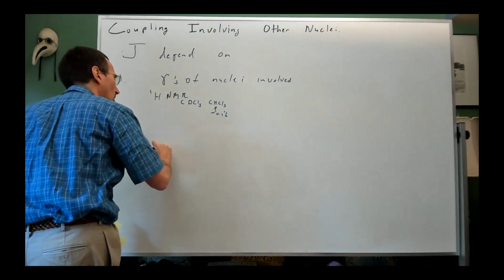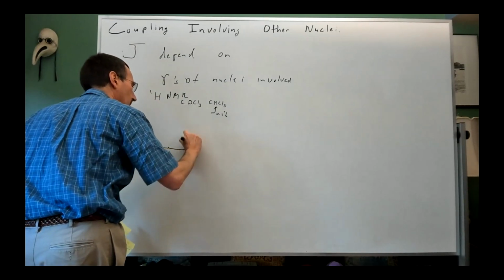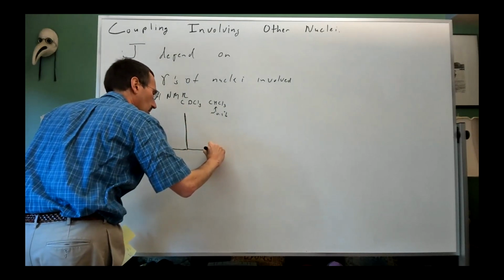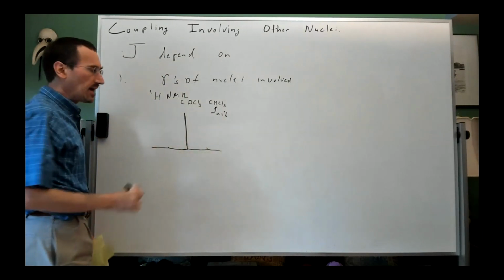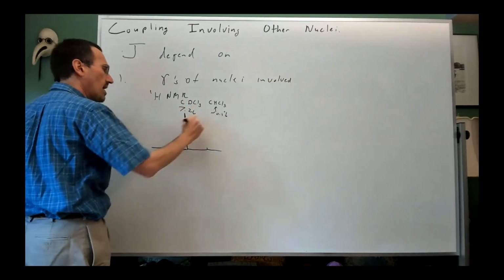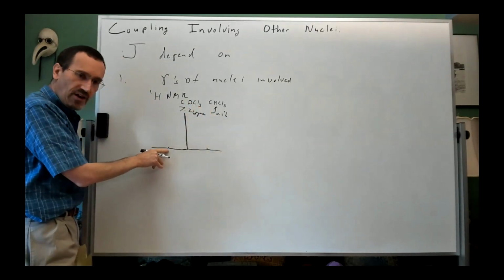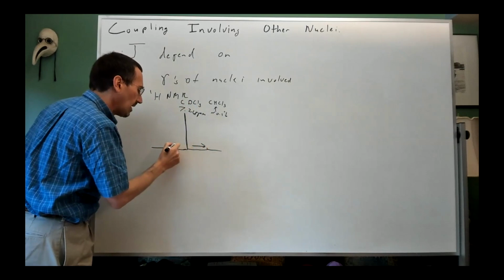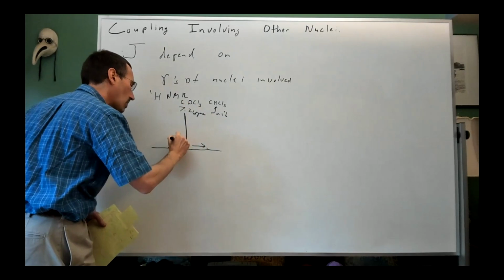And in that H1 NMR spectrum, if the chloroform peak is nice and big, you'll see, and I mentioned this before, two C13 satellites. So the chloroform peak will be at about 7.26 ppm in the H1 NMR spectrum. And then at about 0.55% height, you'll see the two C13 satellites, and they will be 208 hertz apart.